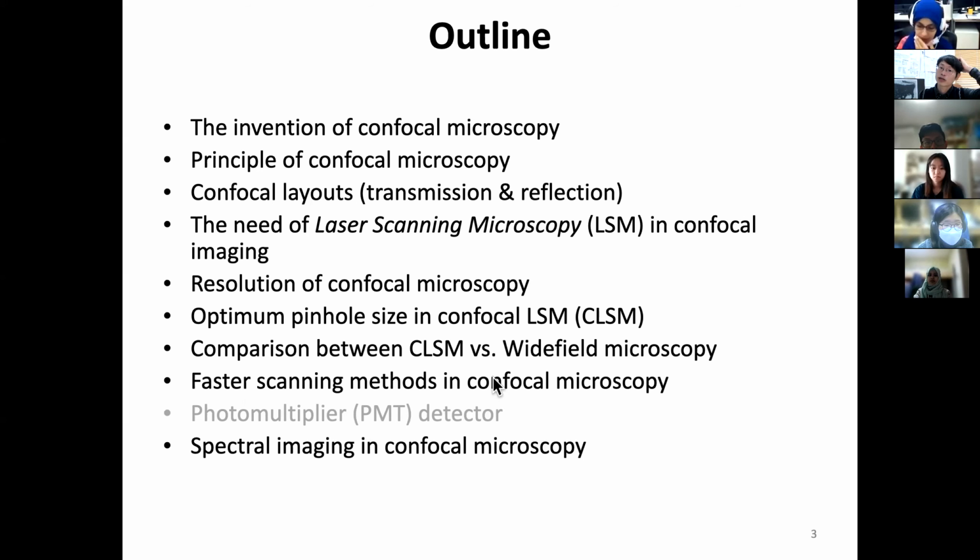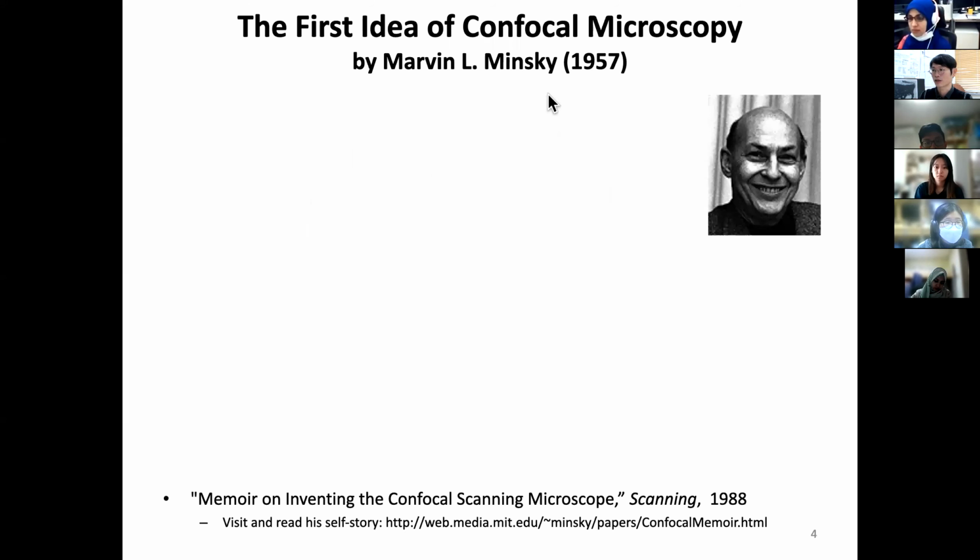And also not only fluorescence, if you consider multicolor extension to a much larger color scale in wavelength, that we call spectral imaging. So I'll introduce spectral imaging using confocal microscopy. So you can unmute, I think, as I will ask you questions.